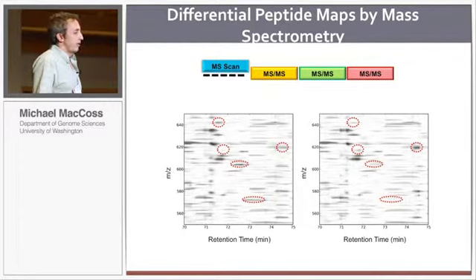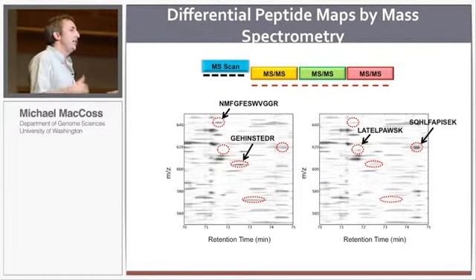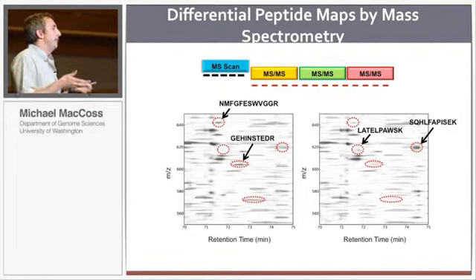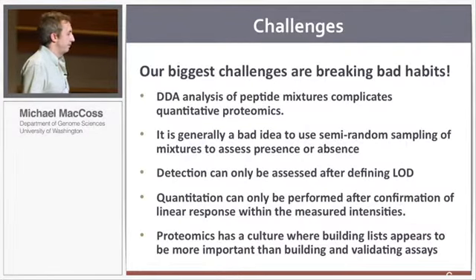We've done a lot of these label-free quant. We've done a lot of stable isotope labeled experiments, but this is just an example where we want to focus on these peaks because this one has gone down from here to here, this one has gone up from here to here, and this one's just gone down, et cetera. And then we can use, of course, our MS/MS spectra to try to annotate these differences. So using accurate mass and high-resolution data in the MS1 mode has been a really powerful approach for us. In many ways, you're taking a targeted approach, but you're first looking at what's different, and then you're trying to assign where your effort is going to be to focus on your identifications.